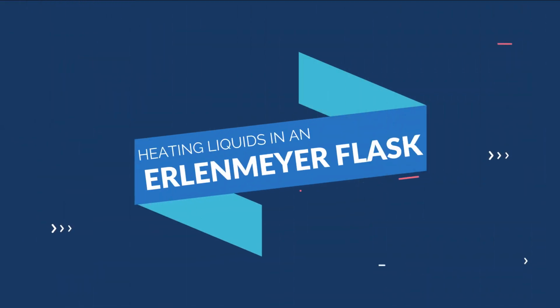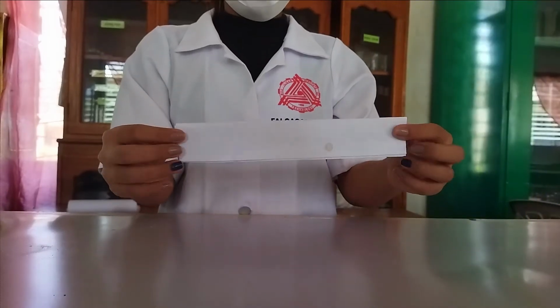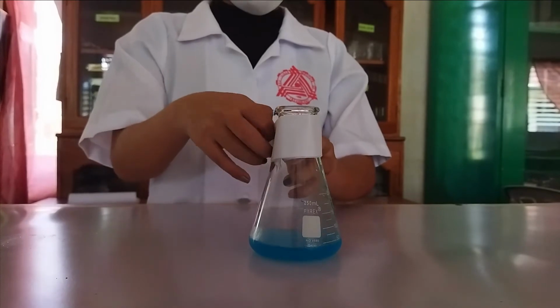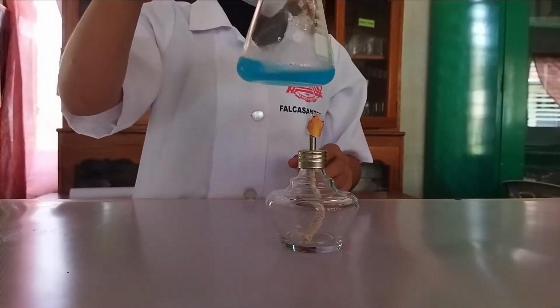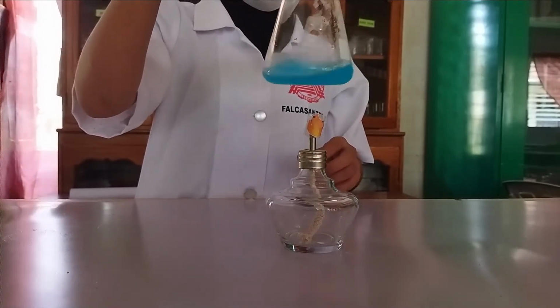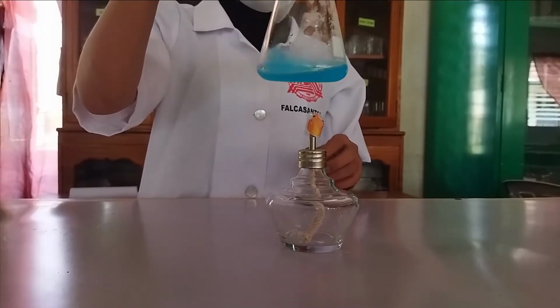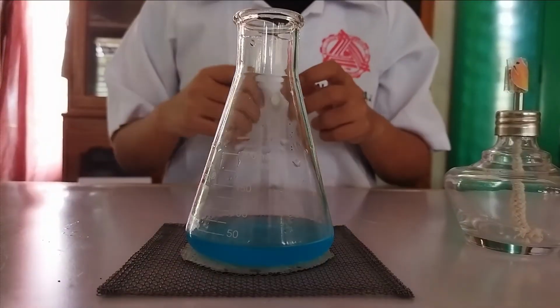Heating liquids in an Erlenmeyer flask. An Erlenmeyer flask less than 1/4 full may be heated directly over a flame. Hold it with a piece of tightly folded paper or flask tongs and swirl it gently. Do not place the hot flask on the laboratory bench. Allow it to cool by setting the flask on a wire gauze.